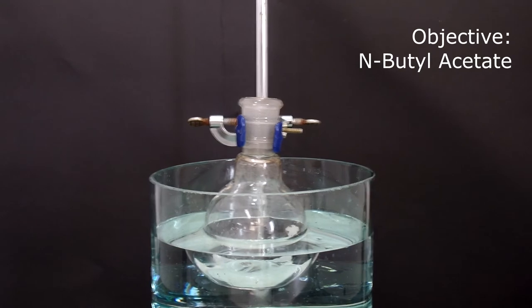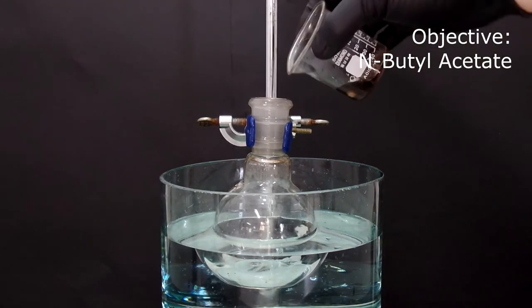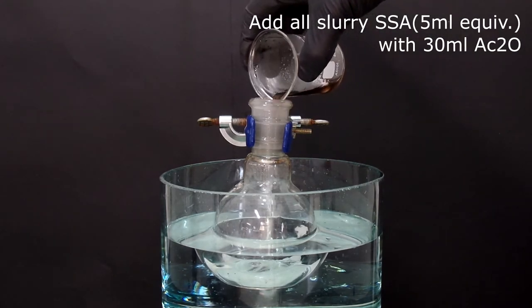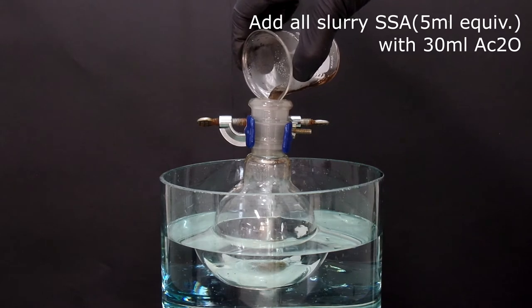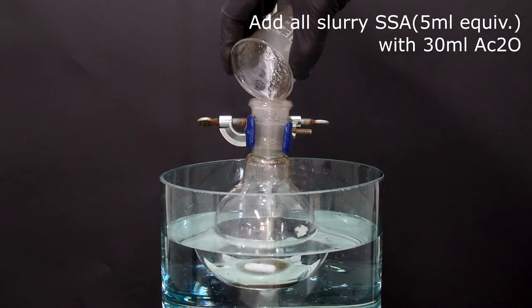In this esterification, I used acetic anhydride and n-butyl alcohol for n-butyl acetate, which has a smell of apple and banana. On the round bottom flask, I put all the slurry silica sulfuric acid mix and washed the beaker with 30 ml of acetic anhydride.